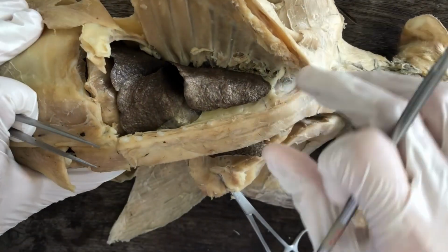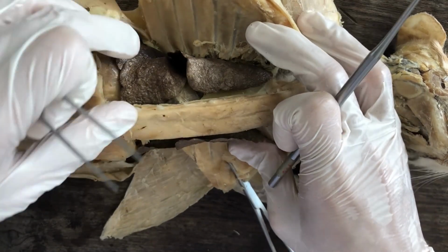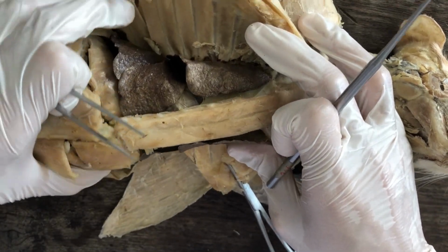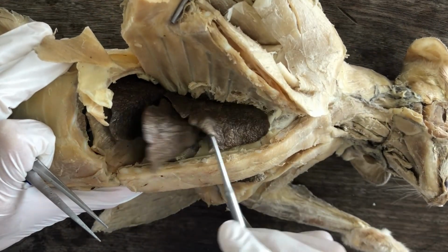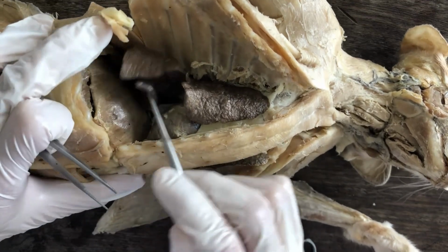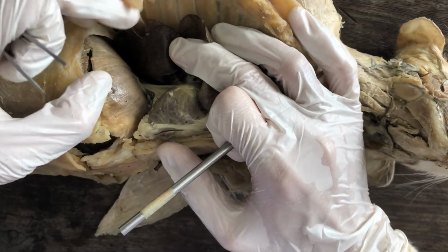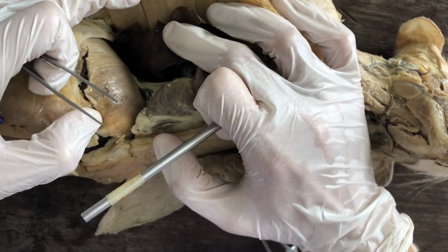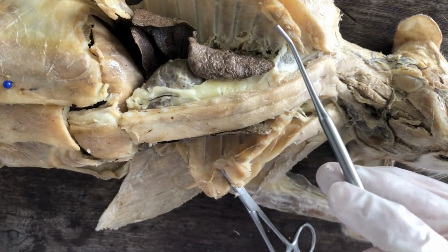Okay, so once you have opened the pleural cavities, the prominent structures that you're going to see will be the lungs, these dark organs here. And then this one is a muscle, that's the diaphragm. Okay, so we'll start with the lungs.